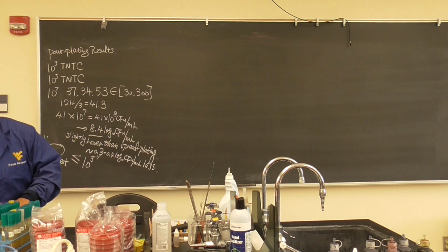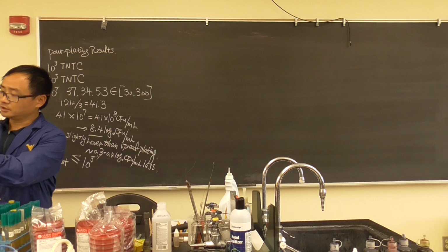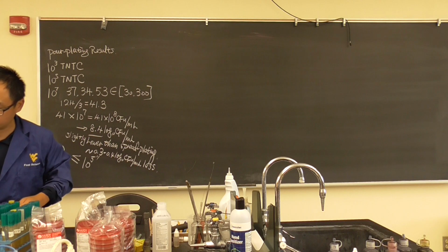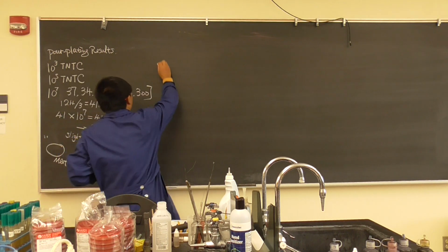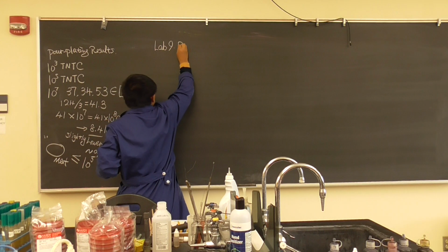Today's lab, I will say, is important. You have a fact sheet right here. And I will talk about our second page. It's a quiz for you. Two of you work together. We will talk about bacterial media. So this will be lab 9. We talk about the bacterial media.